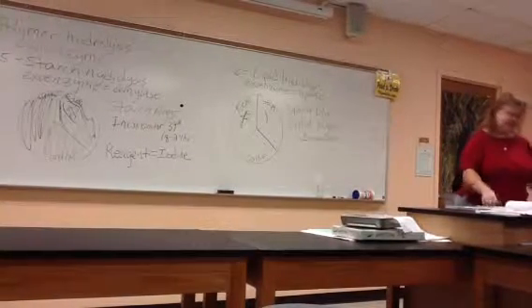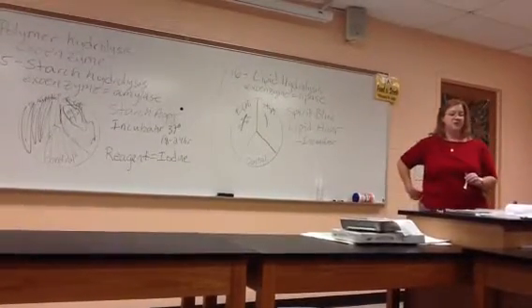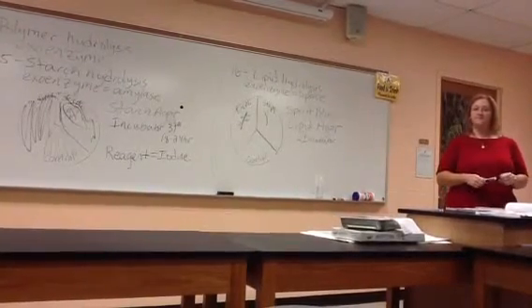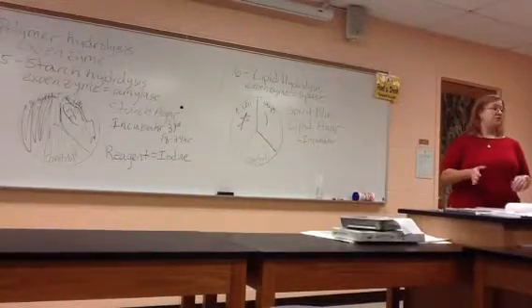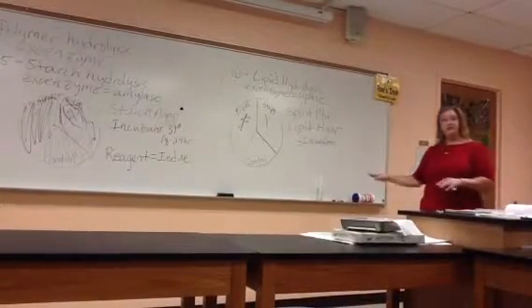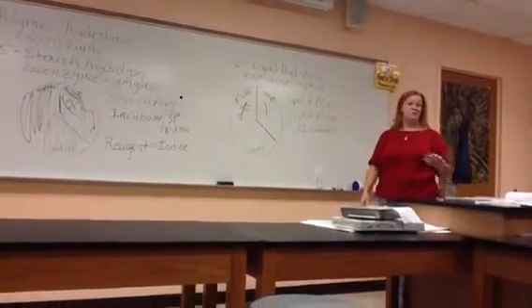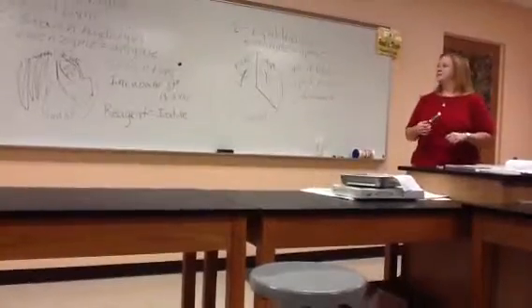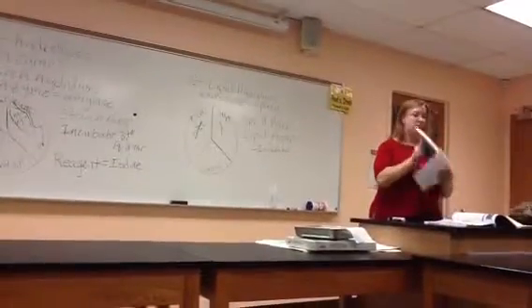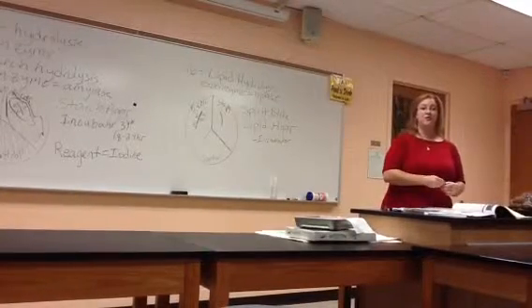The lipid hydrolysis test is on page 77, 78 of your photographic atlas. So again, if you don't have it, just write it down, pages 77 and 78, so you can go back and look at it later. Same things you need to know for this quiz, right? The name of the agar, the name of the exoenzyme. There's no reagent for this one, so you don't have that, but you have to know what positive and negative look like and what positive and negative tells us about the bacteria. And then as always, you want to read through that introductory section, right? Any bold words in there are also potentially quizzable. So make sure you're reading through the lab intros as well.